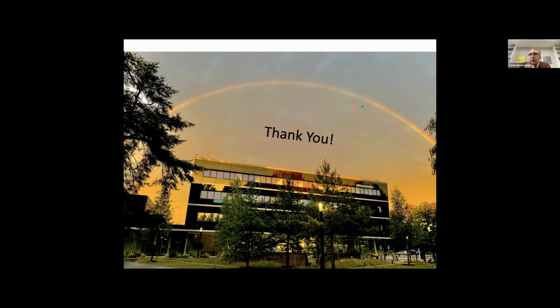If you want to go deeper, then you have to replace the reflected light from the interface by an external beam, because your confocal pinhole ends up discriminating against the light that is reflected from the interface, since it's no longer parallel, and therefore it gets cut off at some point. We have done that, but it makes the setup a little more complicated.